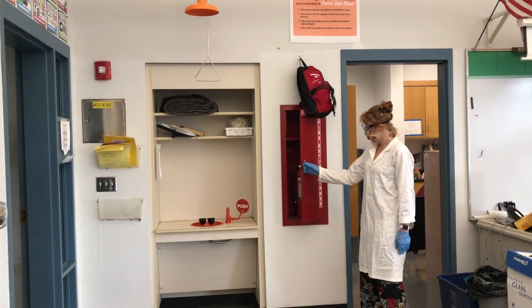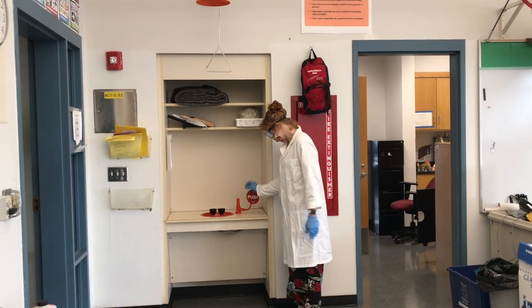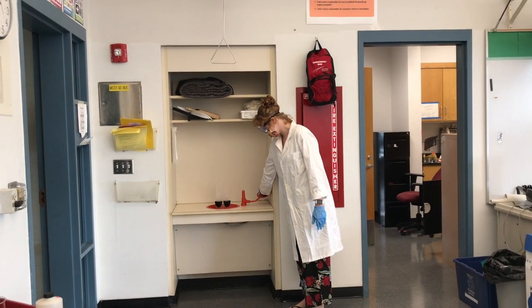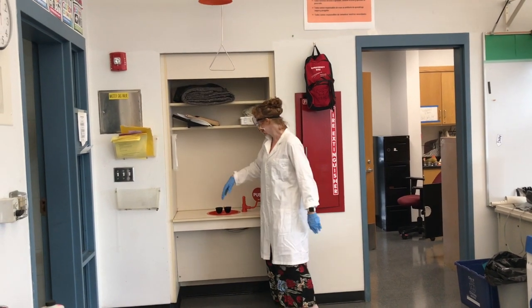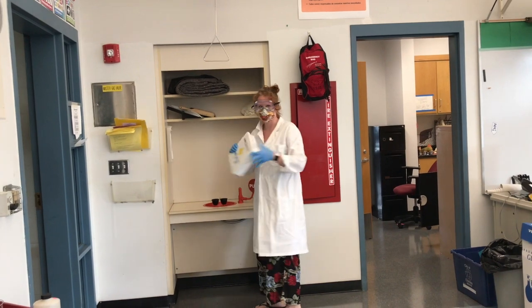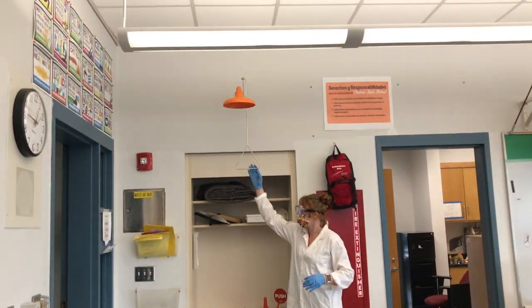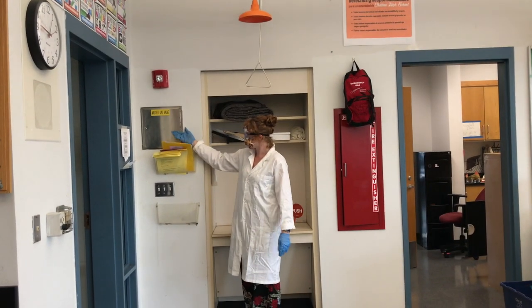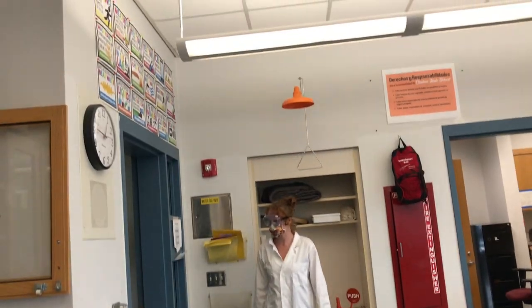In this lab safety space, you will have a fire extinguisher, an eye wash, a fire blanket, and a first aid kit. The shower, the master gas, and lab safety posters.